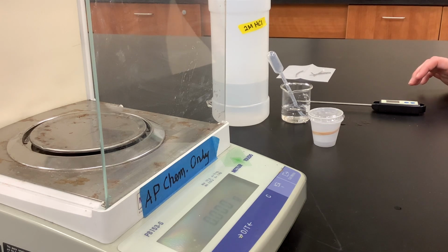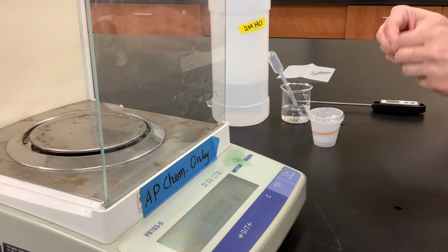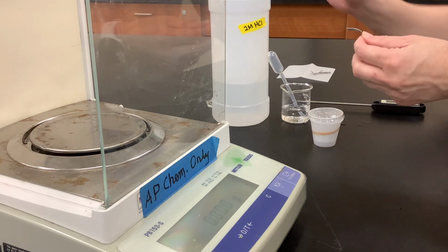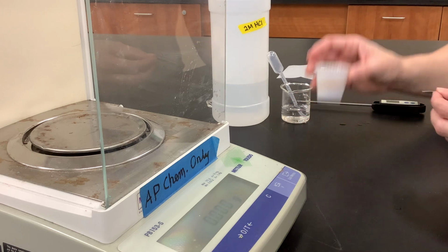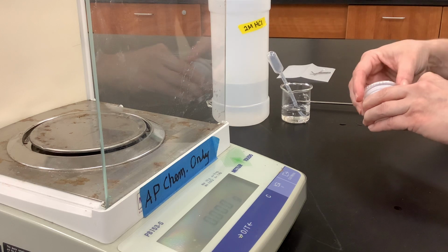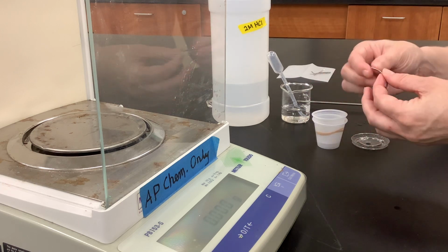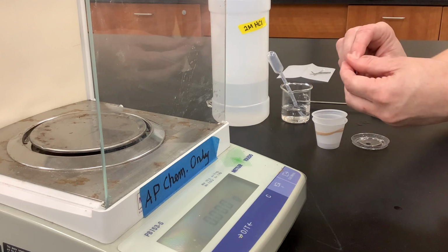So for this laboratory, what we're going to be looking at is the heat of reaction between magnesium and hydrochloric acid. Once again, we're going to be using our small nested cup calorimeter setup, and we're going to be using solid magnesium, magnesium with the oxidation number 0.